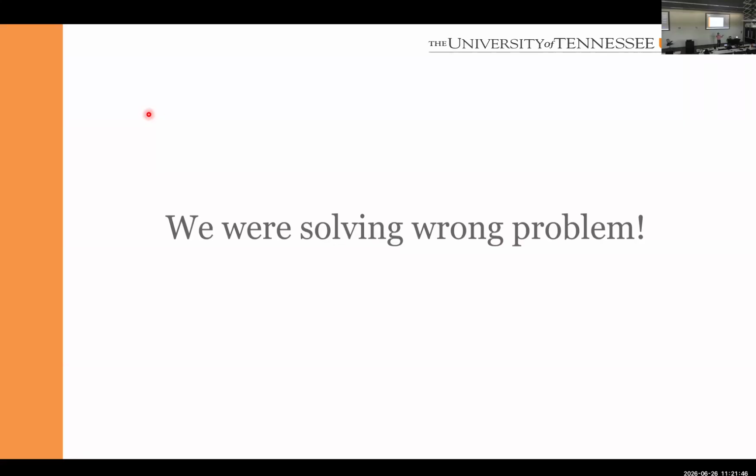It is almost optimal sampling for the unknown property. If we start to sample like this, first of all, most microscopes don't like it. Secondly, as Yanis showed, this type of scanning comes with the accumulation of errors, so we start to have jitter in the image. So in other words, it is a very stupid thing to do. There is no need to do it.